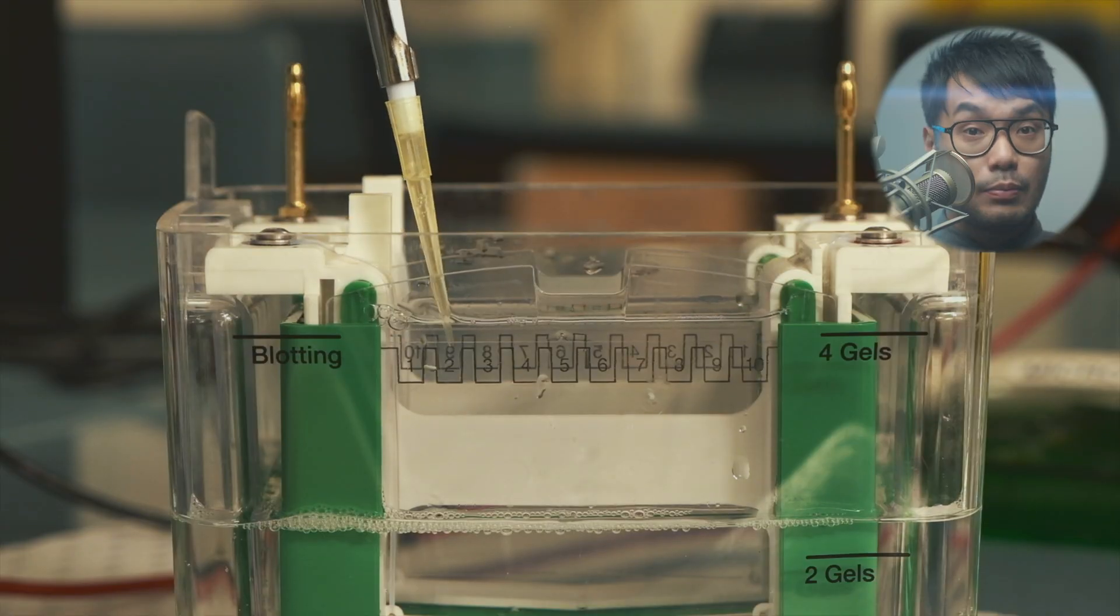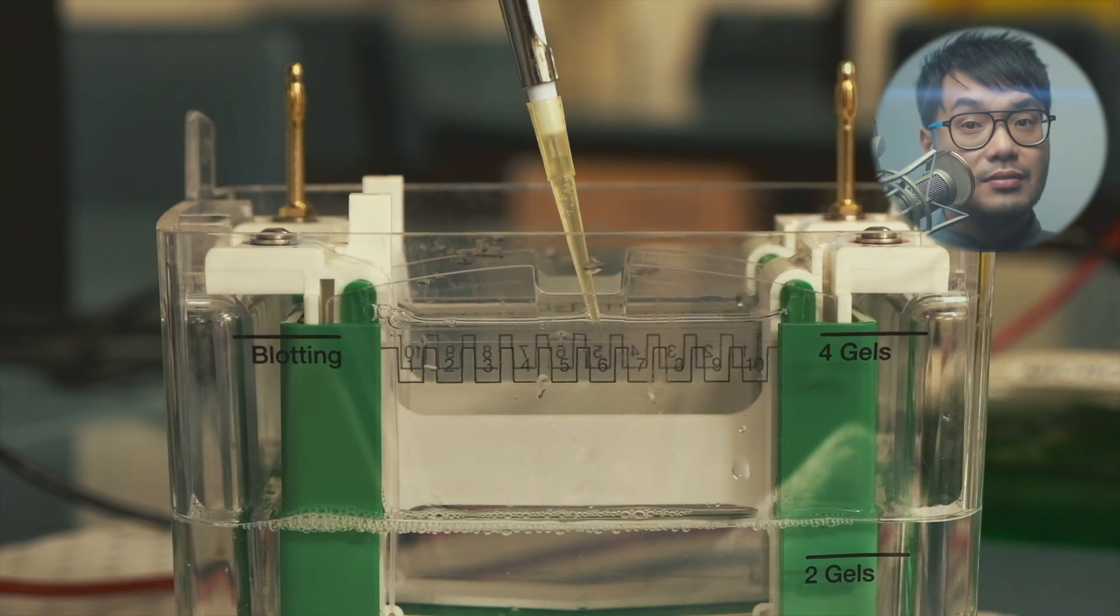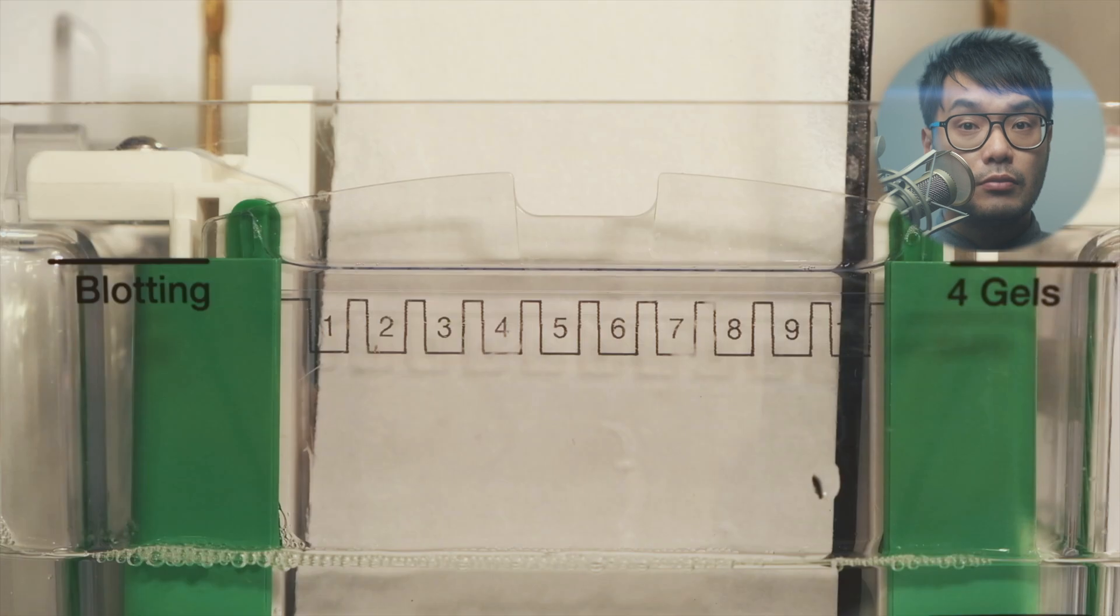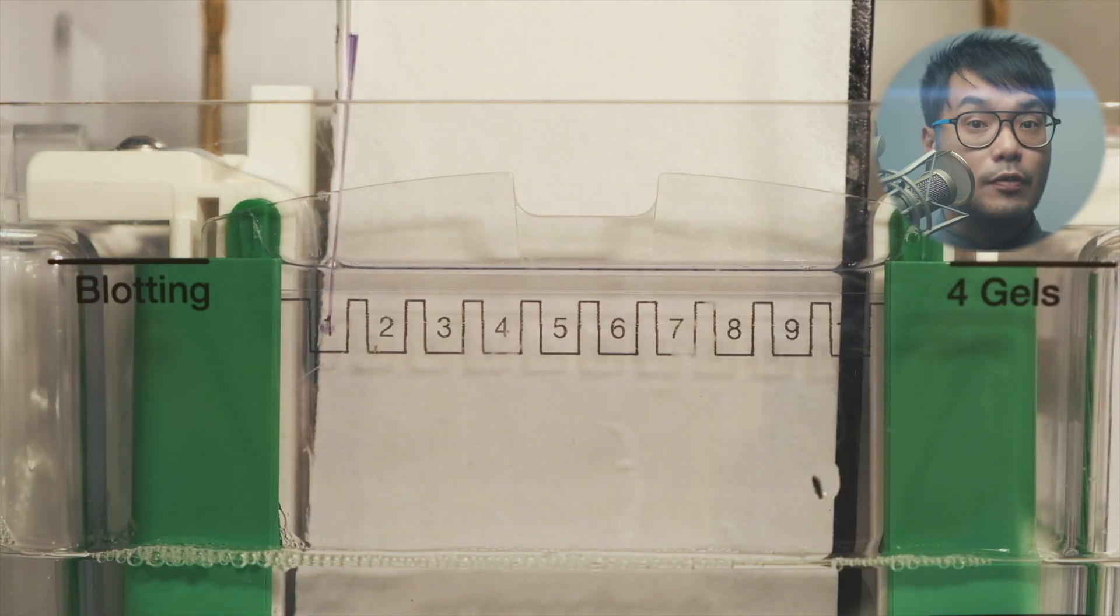The wells need to be flushed out before any sample is added to them. They may contain air bubbles or glycerol, which may affect how neatly your samples go into the well. Protein ladders and samples mixed with a loading buffer are then added in sequence to the gel.